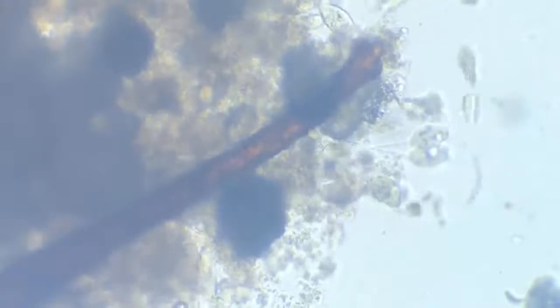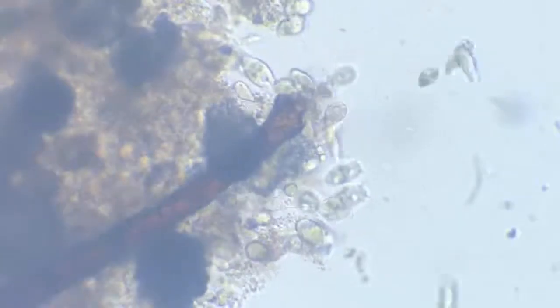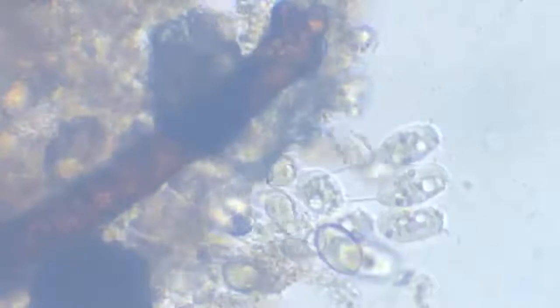And there are the vorticella. You can see the water vacuoles and the funnels and their coils, even their cilia. You can see the cilia move. It is by this ciliary movement that they generate a current of water and attract the food particles into whatever is their mouth. You see that quick recoil.